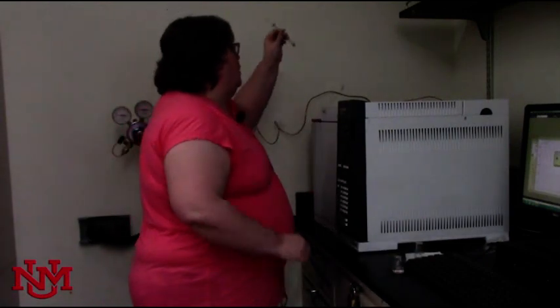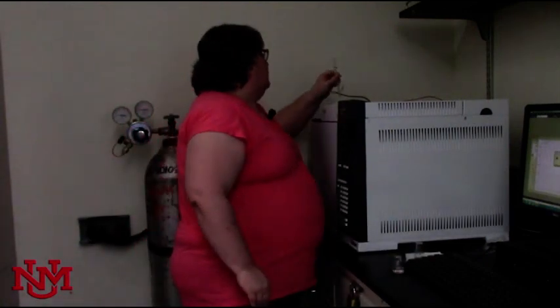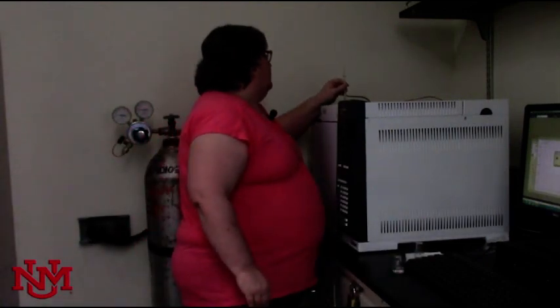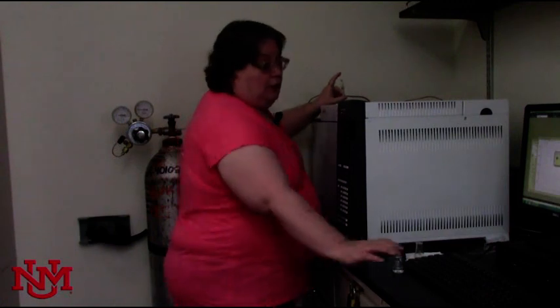You then put the needle all the way down inside the center of the green nut. And then you press the plunger and the enter key.